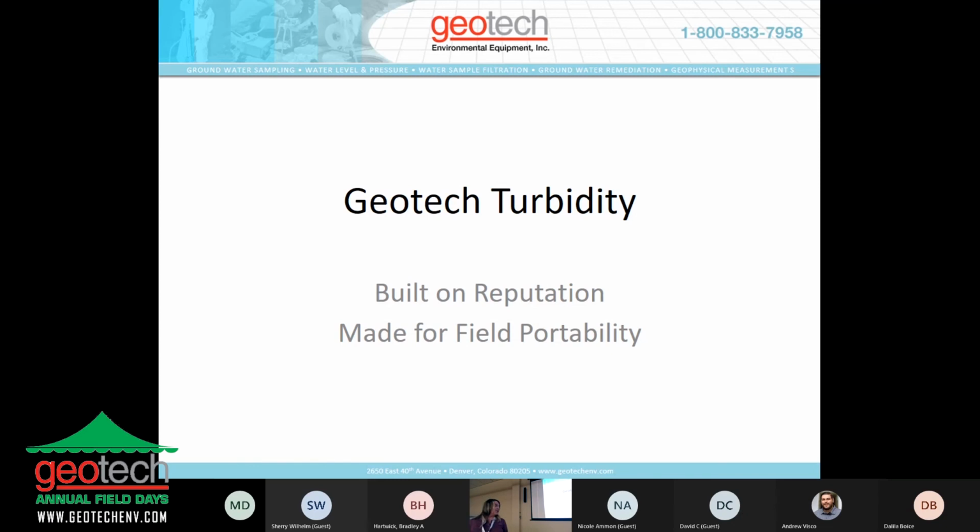And today I will be talking with you about the Geotech Turbidity Meter. More broadly, though, I'm just going to be talking about the principles of turbidity, what it means, why we monitor for it, and how the technology works. So although the presentation is titled Built on Reputation and Made for Field Portability, I wanted to call this turbidity, clear as mud. However, our marketing department shot that down.